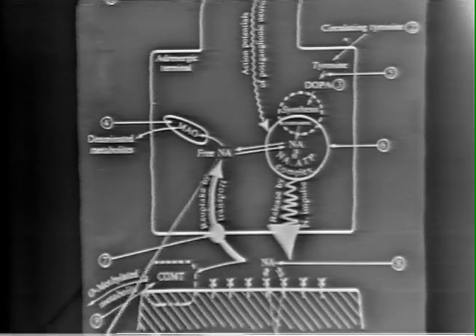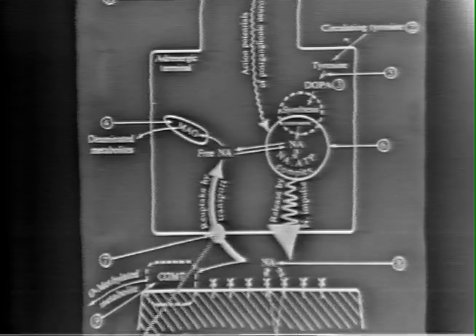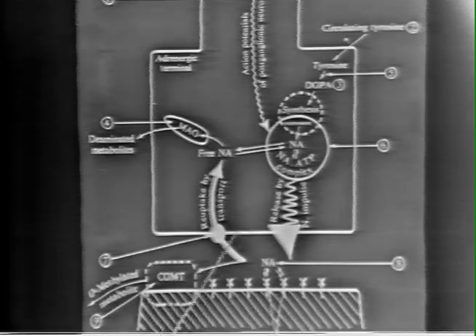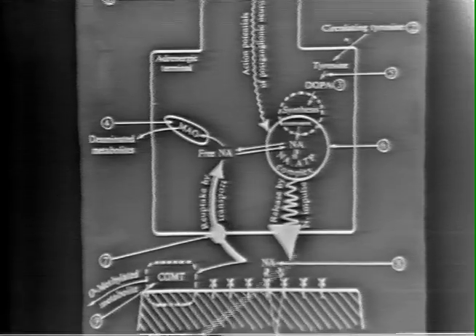Cocaine has the ability to block the uptake of tyramine as well as the uptake of norepinephrine. Therefore, the access of tyramine to the stored norepinephrine is blocked in the presence of cocaine, and tyramine is therefore no longer able to displace the endogenous amine, and as a result, no response was obtained.